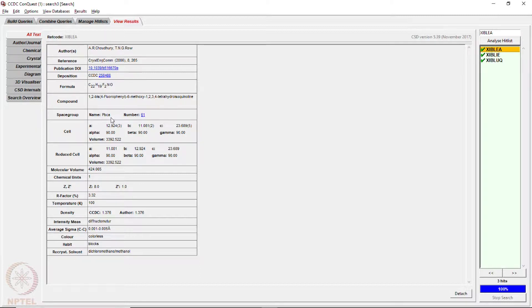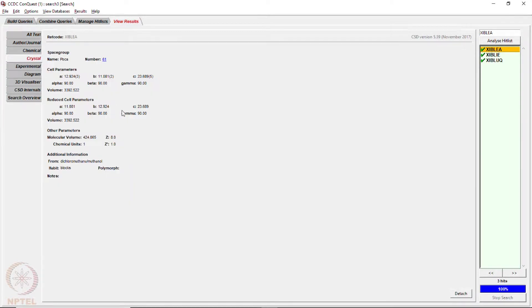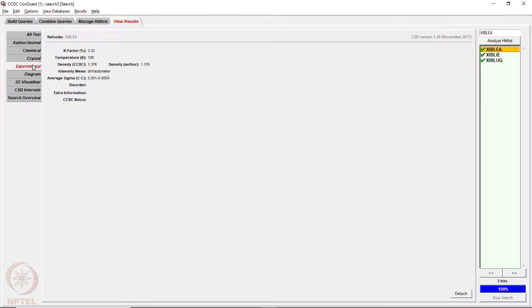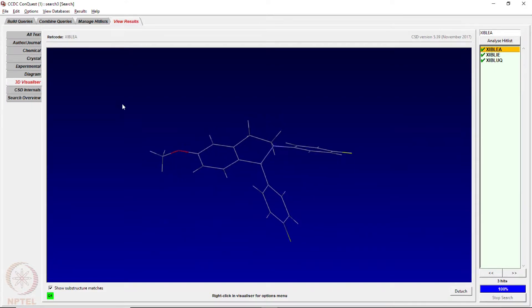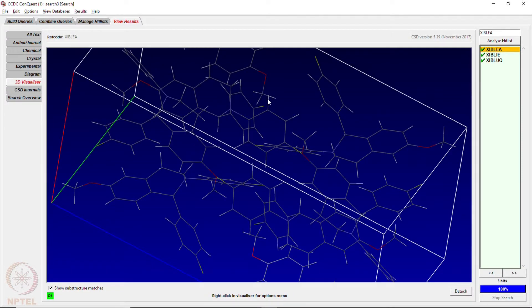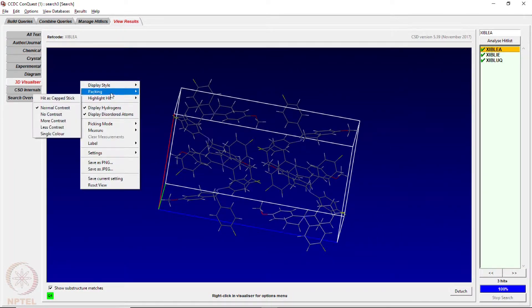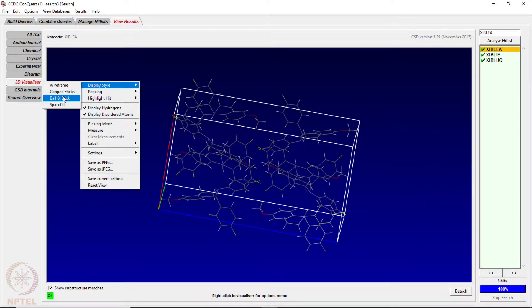It gives information about the crystal structure: the space group, unit cell parameters, molecular volume, R factor, temperature of data collection, calculated density, and data about the crystal in terms of color and habit. Going to 'crystal information' gives only crystallographic information. 'Experimental' gives details about the R factor and experimental conditions. Going to '3D visualizer' displays the molecule in 3D, allows packing, and lets you change the display style from wireframe to ball and stick.